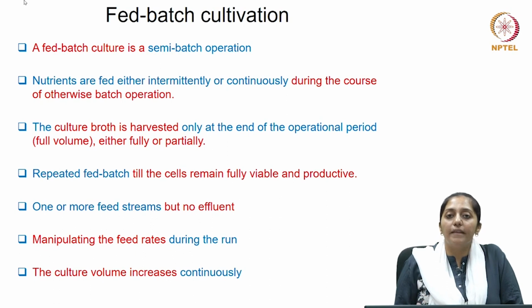How long the feeding is to be continued, which means in what way the feeding is done, whether you would like to do it intermittently as pulse feeding, or continuously as step feeding once started, or keep varying the flow rate throughout the feeding following some trend like exponentially increasing feeding and so on.